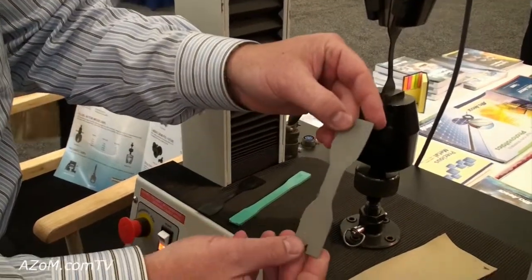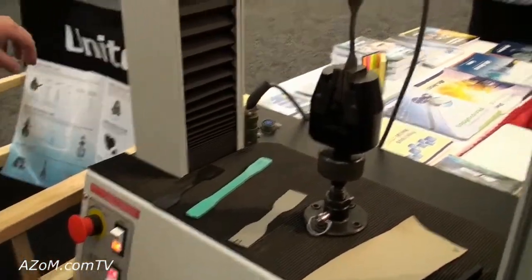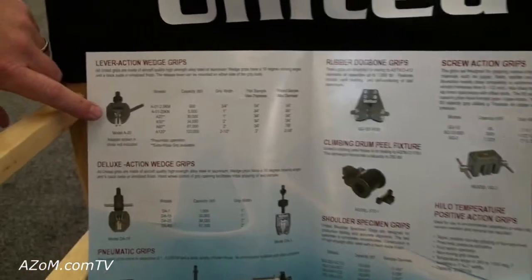Same thing here on a leather interior sample. Here's a variety of our fixtures that we have — this would be like a standard lever action grip.